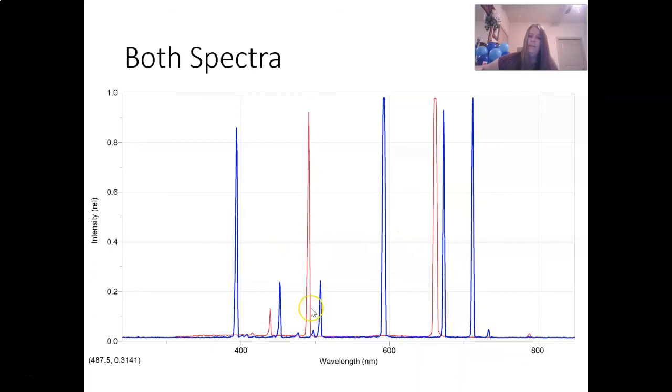You can see they are similar in color, but the wavelengths are different. And in helium, there are peaks where there is nothing at all in the hydrogen spectrum. And so that's one of the ways that they could tell that these were two different elements with two very different electron configurations, because they saw different energetic transitions.